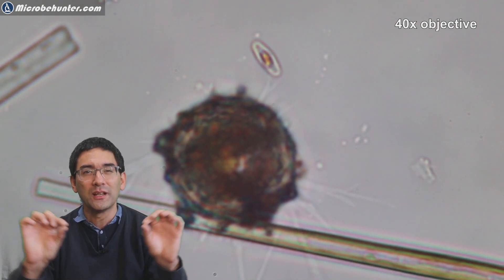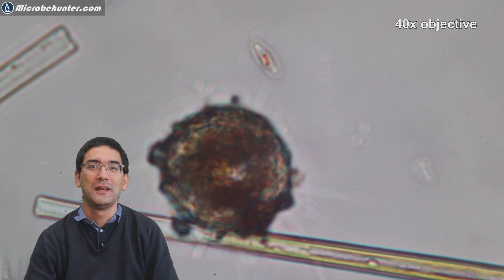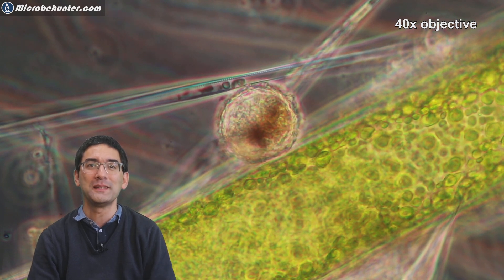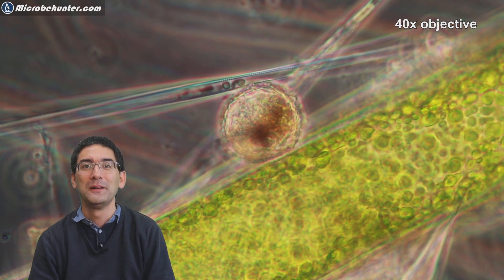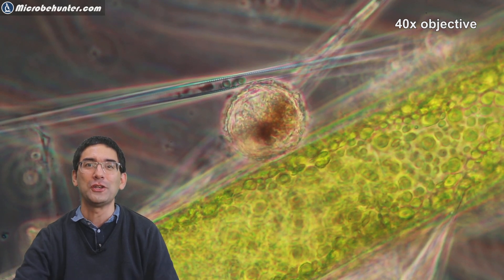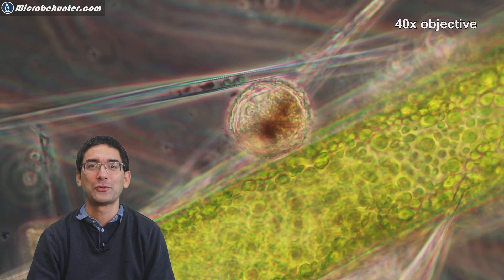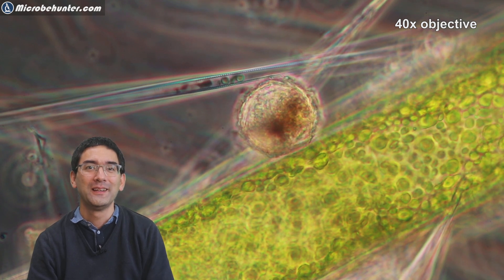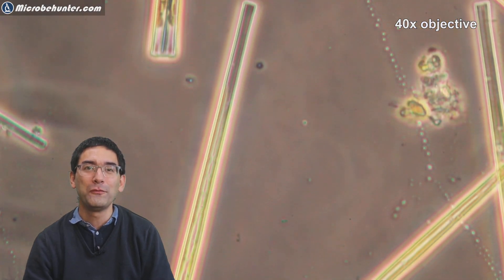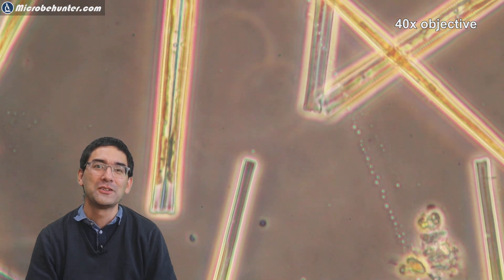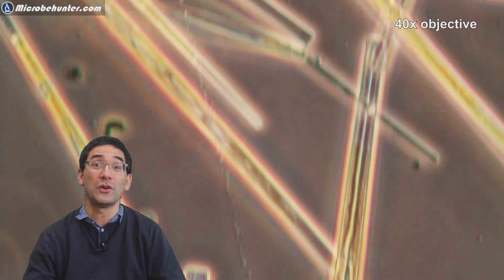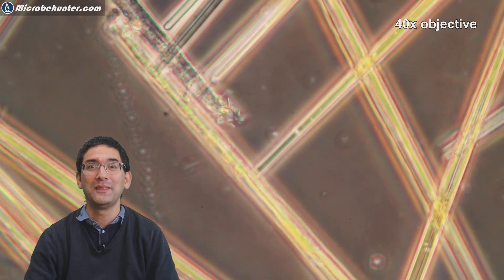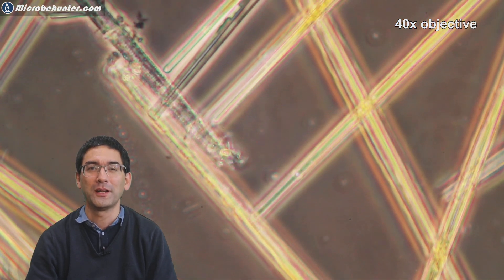I tried phase contrast as well to give you also a different view of all of those specimens. That's again the test state amoeba in phase contrast, crawling along an algae. So with different microscopic techniques, this of course expands your horizons as well. Here again the diatoms from before under phase contrast. So many things to find, and I have to admit, all of this was only on one slide. So I did not have to repeat the whole thing, only on one slide, and so many things to see.